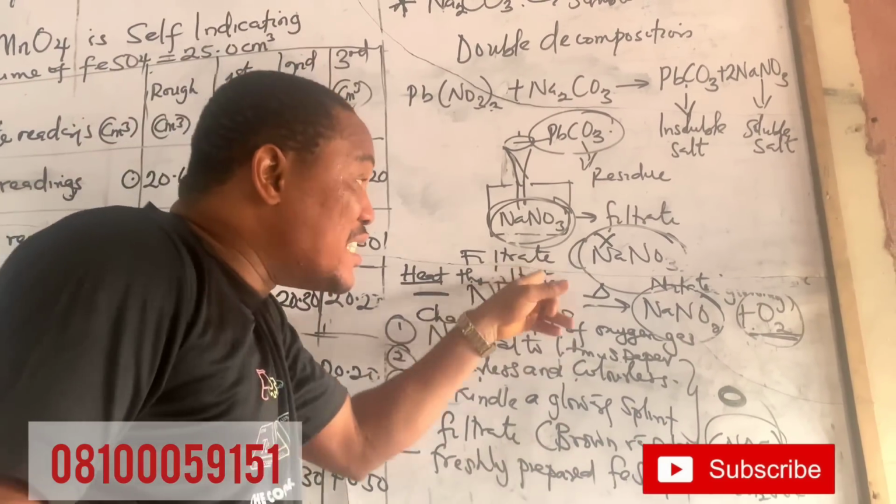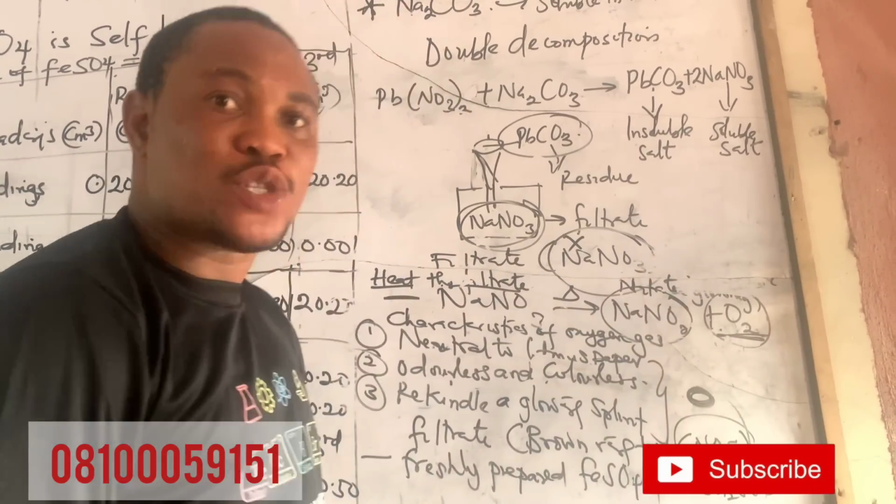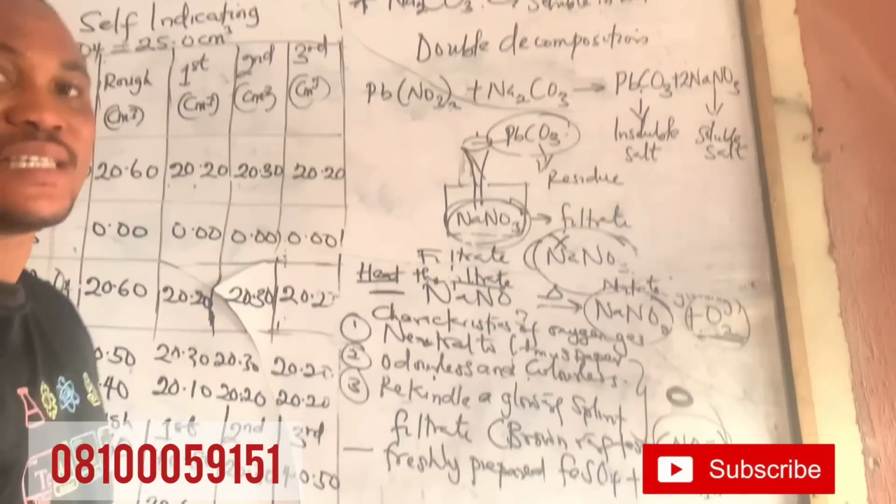Because you already know the reagents. The reagents they are telling you to add will tell you what you are testing for. That's why we are doing all this analysis on this channel.